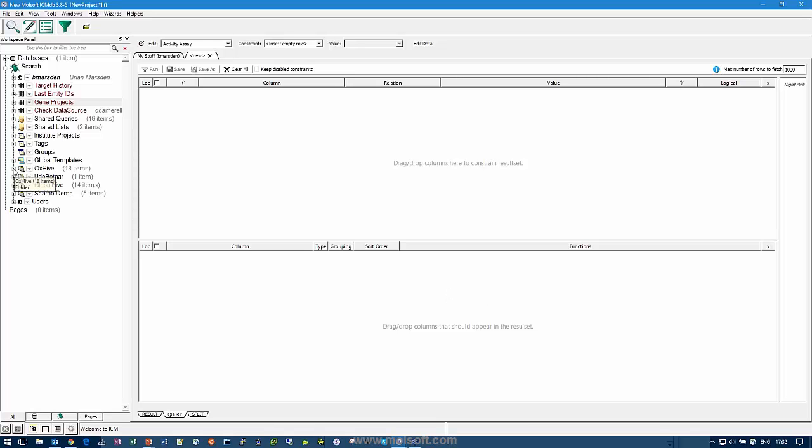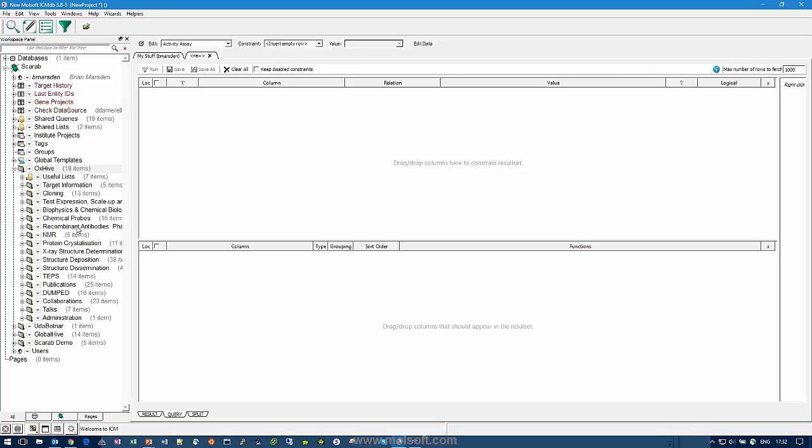So what I'm going to do is look in the SGC schema, so you're all going to have to promise that anything you see you don't repeat to anybody.